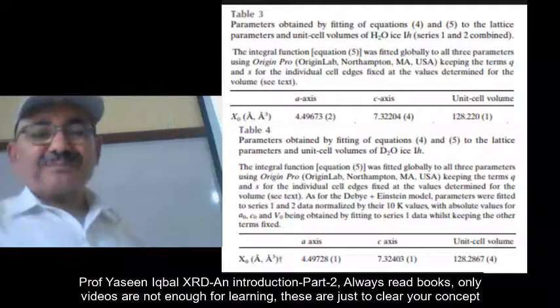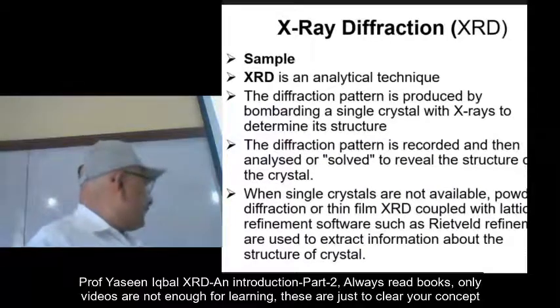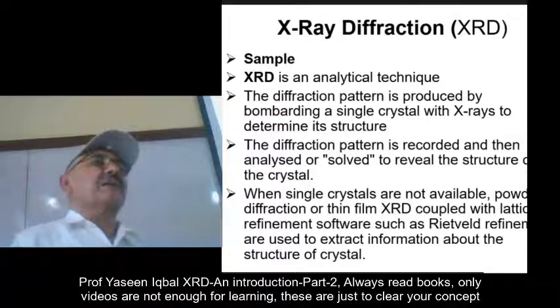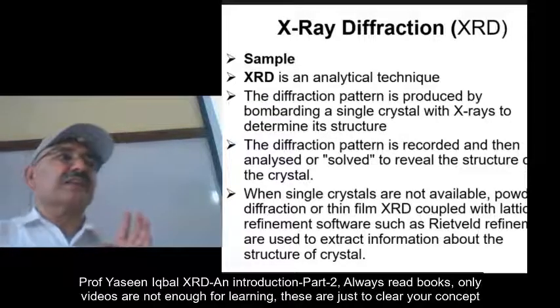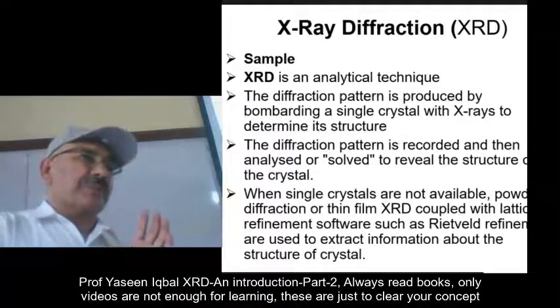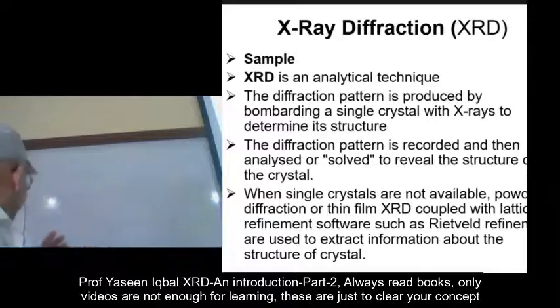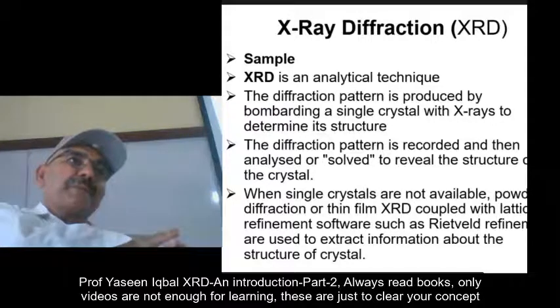But using the simplistic approach, if single crystals are not available, then you have other two options. I will say three options. One option is this, that you make powder of your sample. Make powder of your sample and put it in the sample holder, fix it.